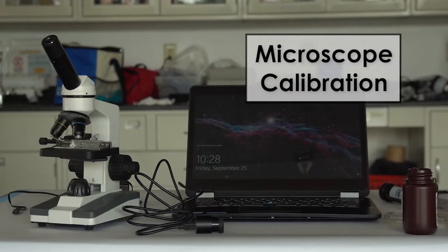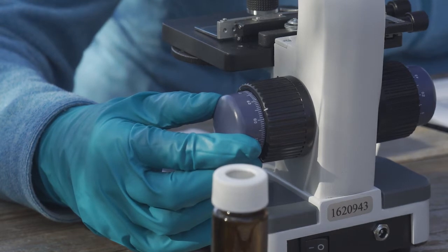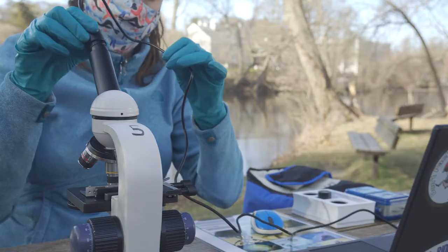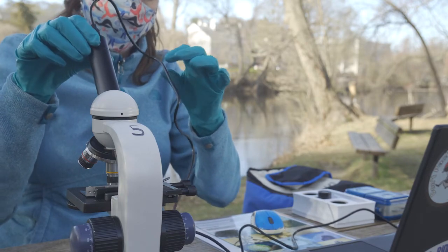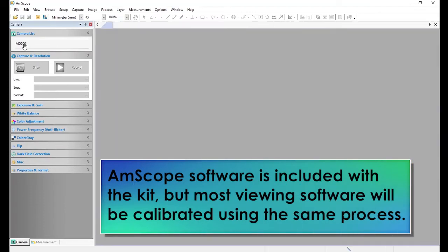This video will show you how to calibrate your microscope. First, you want to make sure the calibration slide is in focus before replacing the eyepiece with the camera. After it is in focus, connect the camera to the computer. Select your camera from the camera list. This will project a live active image on your computer screen.